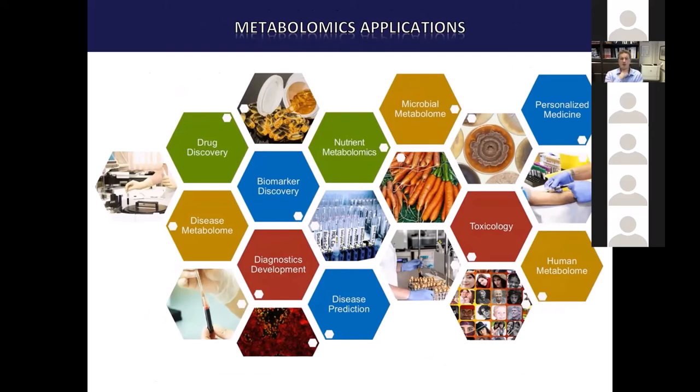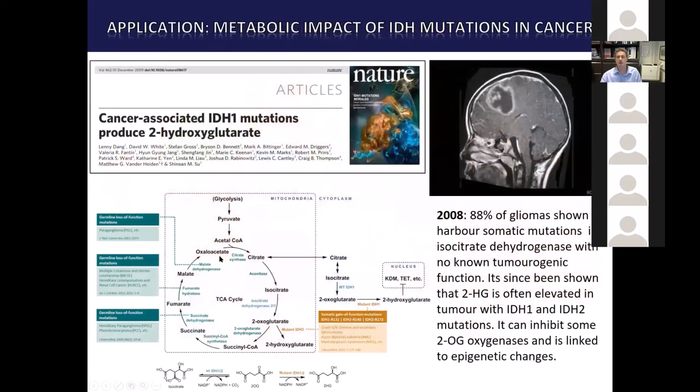This slide is just a holding slide really to show that once you have that overall workflow, you can then apply it in a whole range of areas, and metabolomics is now reaching out, and has been for a number of years, into a whole range of application areas across different types of scientific discipline. And I just want to focus in this talk a little bit on drug discovery and biomarker discovery, and what we can tell about the underlying disease etiology and how that's reflected in the metabolic processes that we can identify. So I'm just going to zoom in on that in an example.